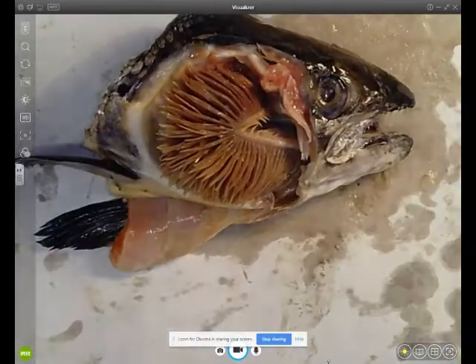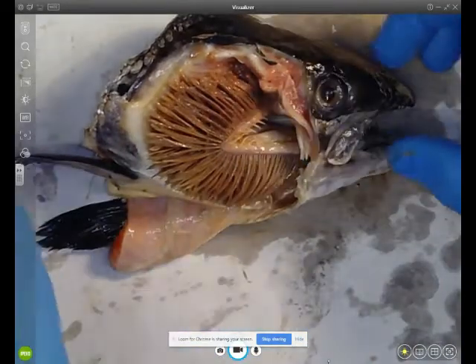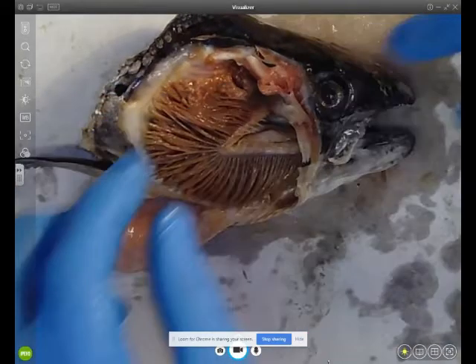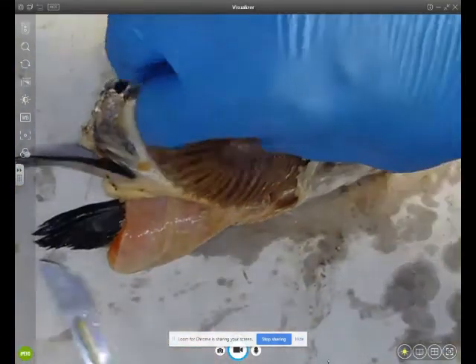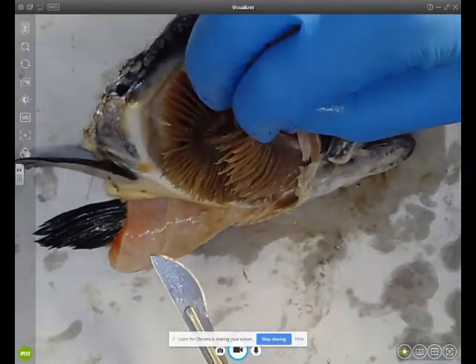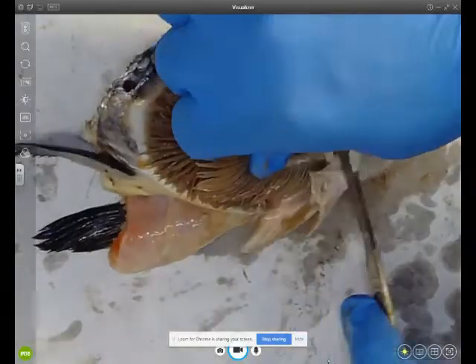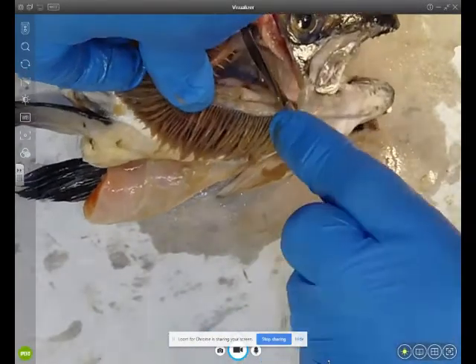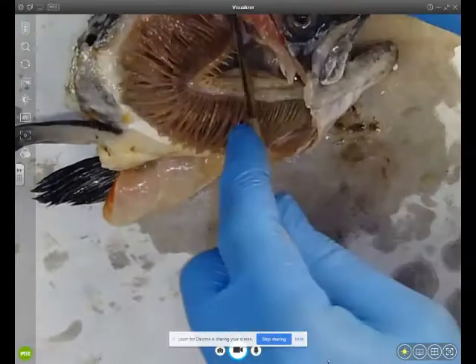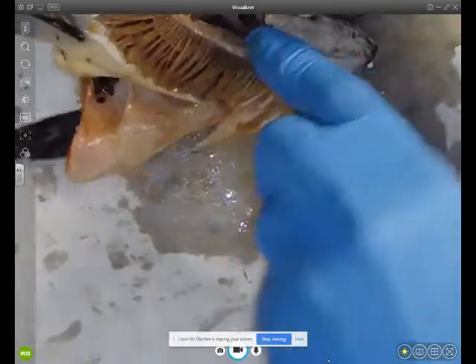There are four gill arches within each gill. What I'm going to do now is cut one of the gill arches out so we can have a better look at the structure. They are firmly within the head so you have to really push in to break the gill arch out.